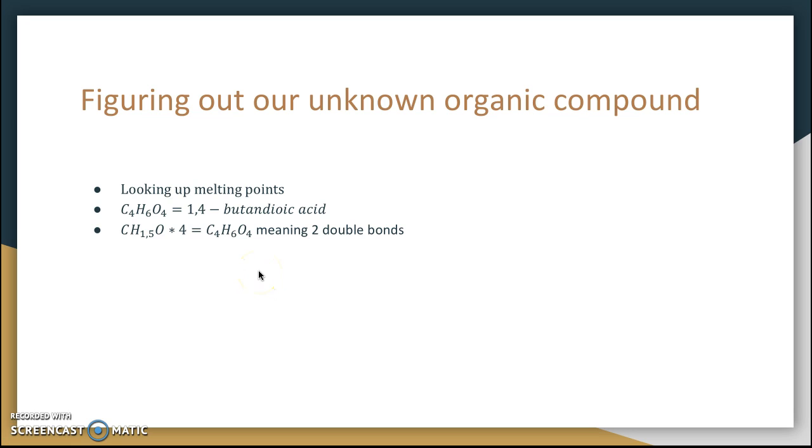And we did that because it has a melting point of 184 degrees, which means it almost matches up perfectly with our organic compound.